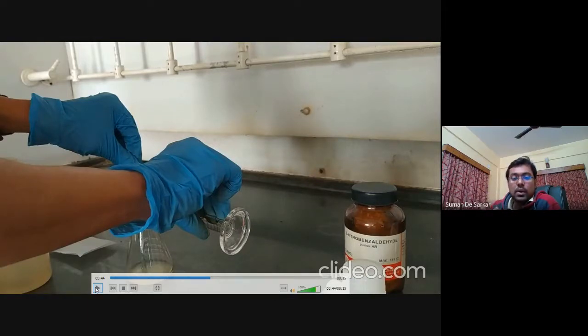water. But when we are adding water into the acetone solution, it's a mixed solvent, so it's also good enough. But if you add water too fast, then in some portion the ratio of water will be too high compared to acetone, right? In that part, whatever ortho-nitrobenzaldehyde is there may precipitate out. So we don't want that.